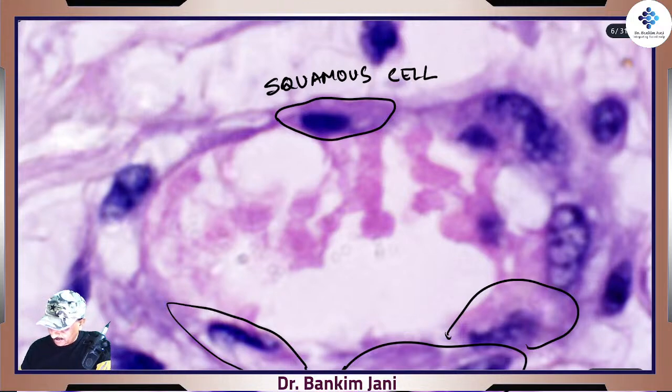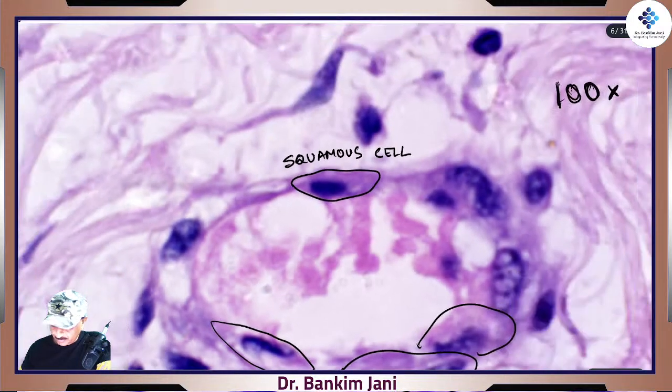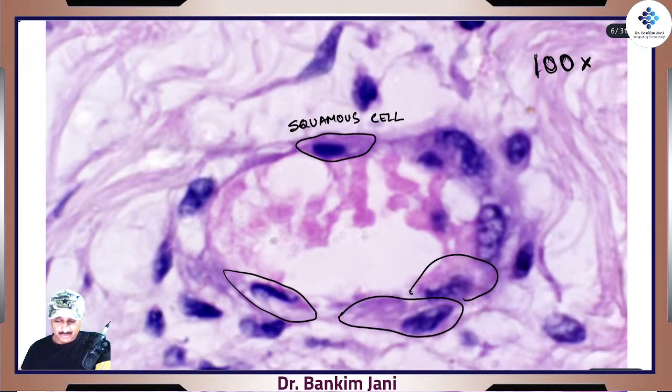Now when we unzoom or go back to our original size, it makes sense. Okay, this is how the cells look. When we take a section, why does it never look like, say, if this is the arteriole, I'll draw it here, why are the cells not exactly looking like that classical picture?